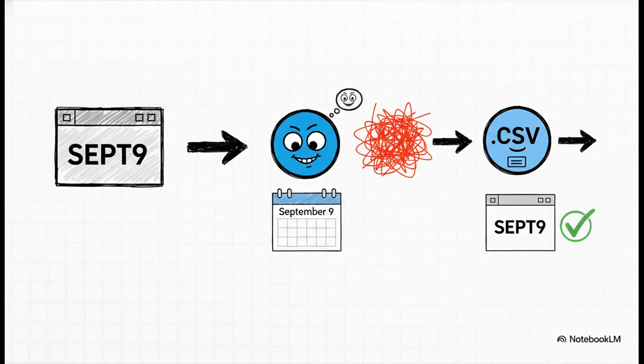And hey, here's a pro tip that will save you from a massive, massive headache. Save your file as a .csv, a comma-separated values file. This one simple step stops spreadsheet software from helpfully auto-correcting your gene or protein names into calendar dates. You know what I'm talking about. It's a classic, frustrating problem, and this solves it.